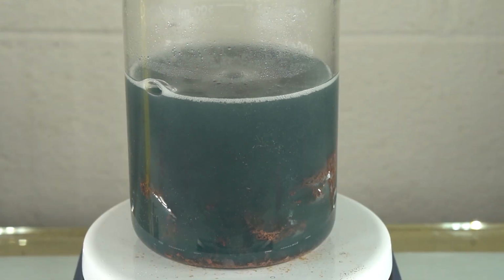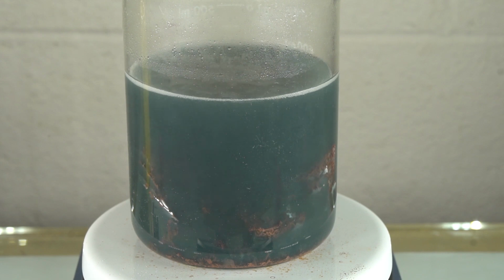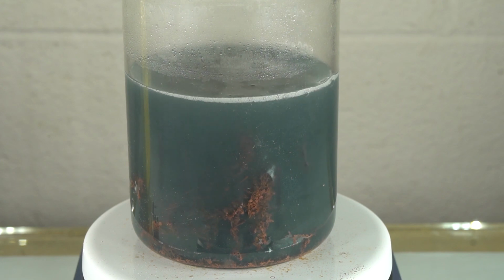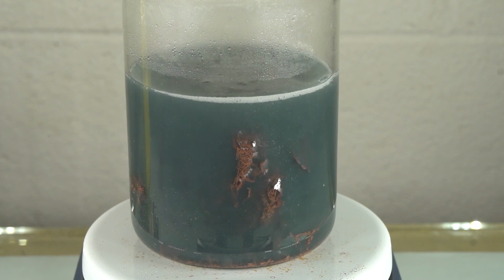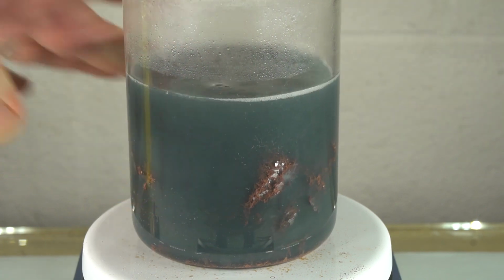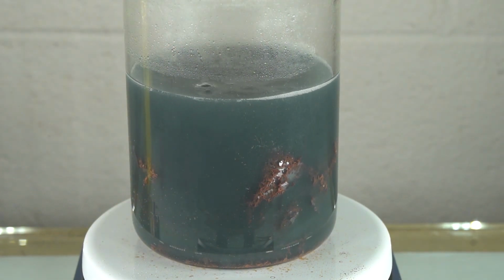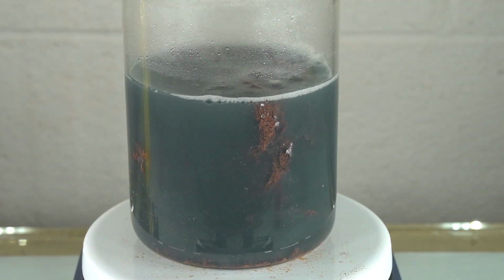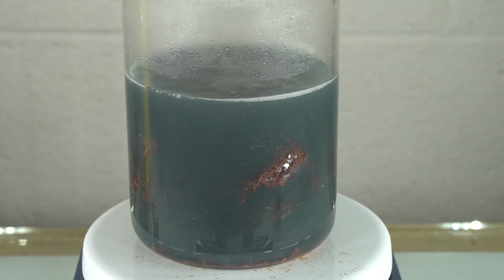So this has been going on for about 10 minutes, and there's actually a decent amount of hydrogen gas that's been coming out. The conversion to copper has been happening quite rapidly. I'd say a good portion, most of the aluminum has been converted to copper just in 10 minutes. And the beaker is actually quite hot. This is quite an exothermic reaction. It's not going to cause the water to boil, but I would not want to be holding that beaker. It would be very, very hot in my hand.